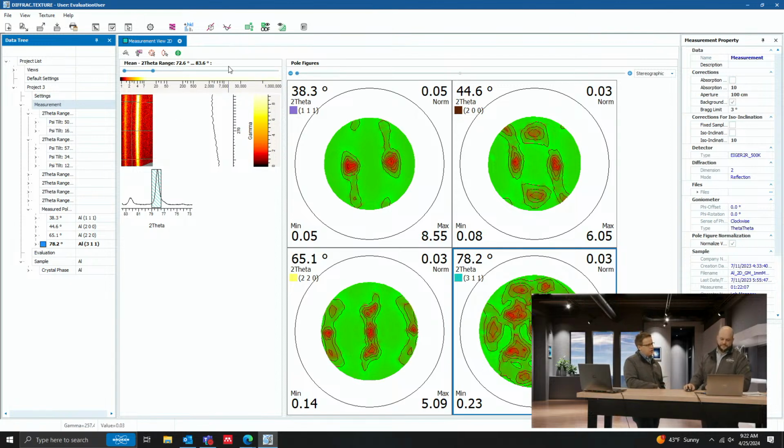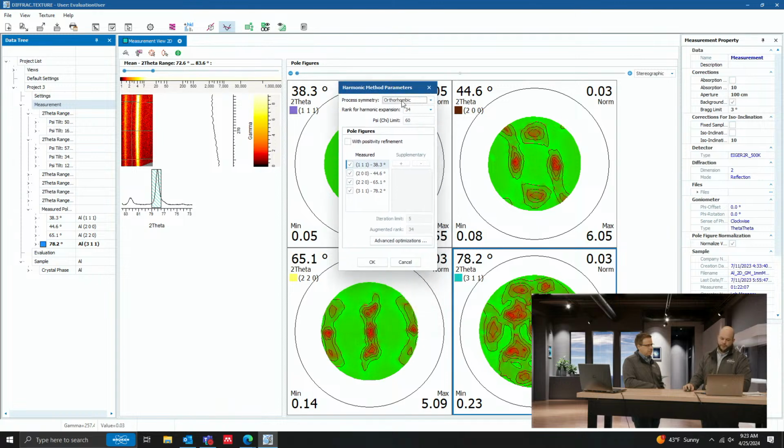So a very, very interesting approach to actually bring to the software, and I think unique actually to this. For sure, and there's some new things in there with this software at least that I'd like to show with the component modeling specifically. Okay, so spherical harmonics, a great way to start, especially if you've got good coverage here. We'll go ahead and just perform a quick few of them.